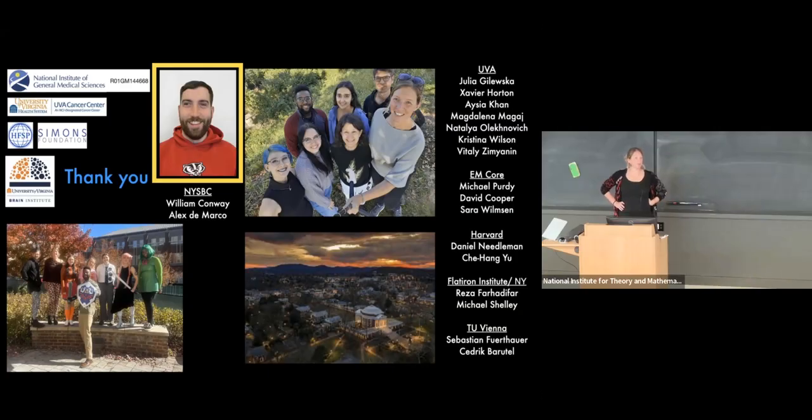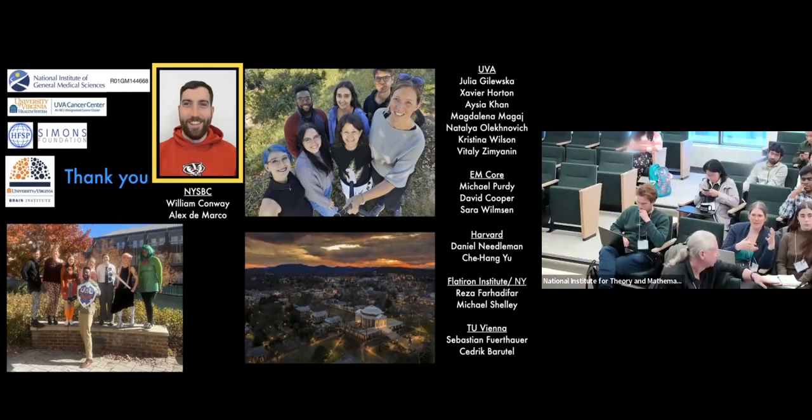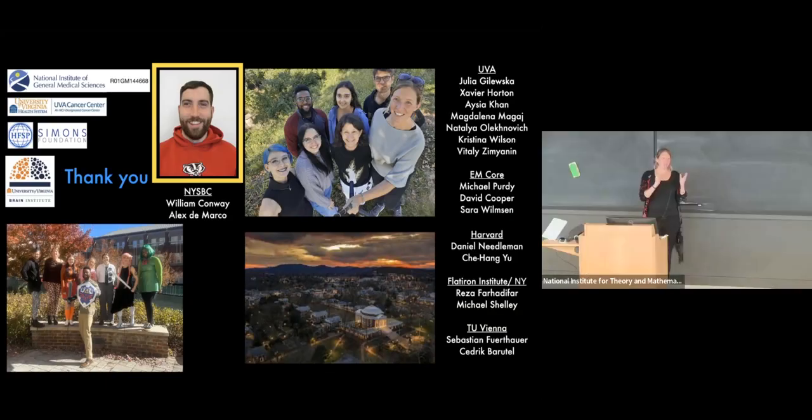Just curious about how to bring all the data that's out there together. Also, the packaging, if you do plastic, there is deformation, right? So you don't know if what you're looking at, and it's anisotropic. So not every region of the embryo will shrink in the same way. So you kind of don't know if you can trust it or not.